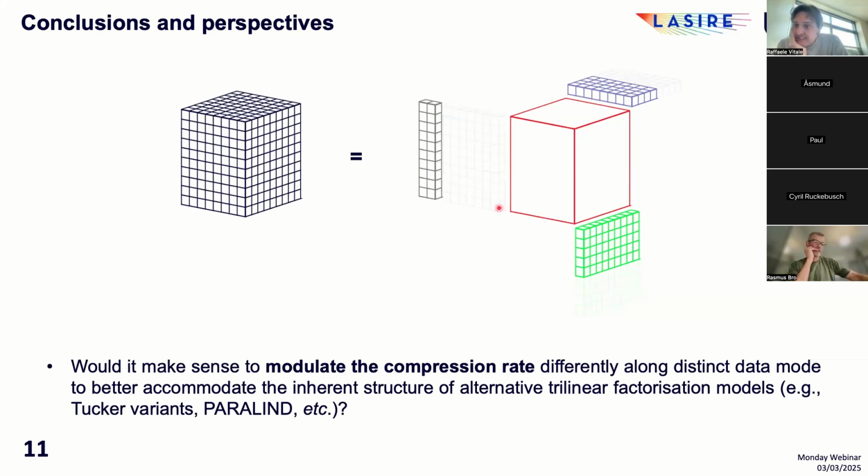So to be honest, I have not played with really complex samples in the three-way domain. But we have analyzed systems characterized by 8-9 components, namely pharmaceutical systems, by two-way approaches, so standard MCR-ALS, and we have rather surprising results also in that case.